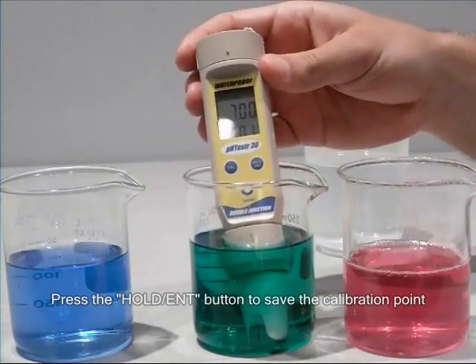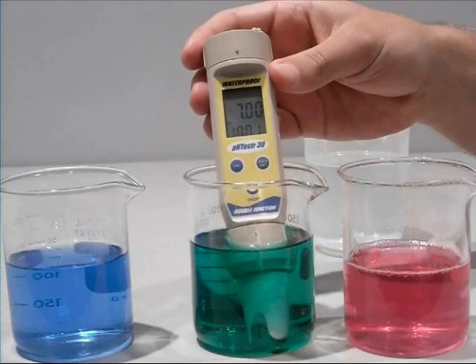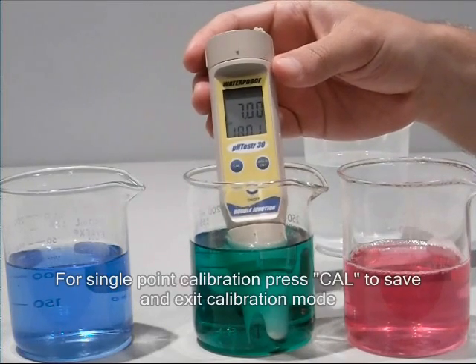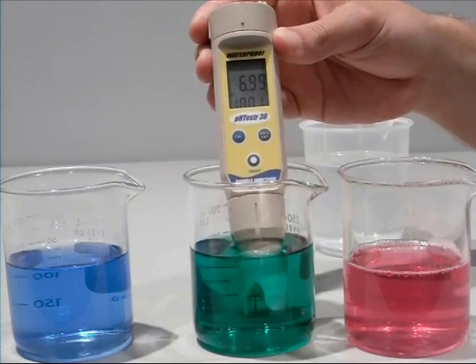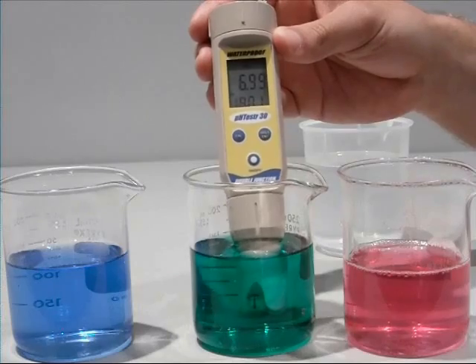If you are doing a single point calibration, press the CAL key at this point to exit calibration mode. If you are doing a multi-point calibration, the lower display will now switch between 4 and 10, the other calibration buffers.